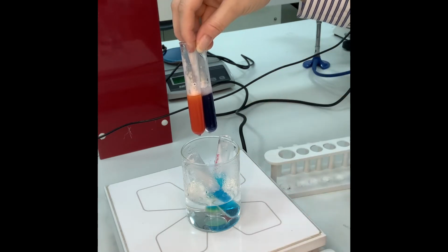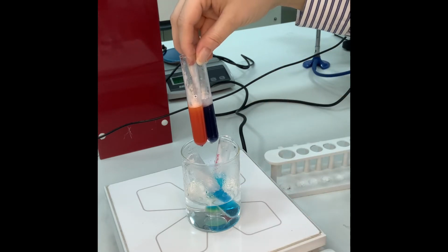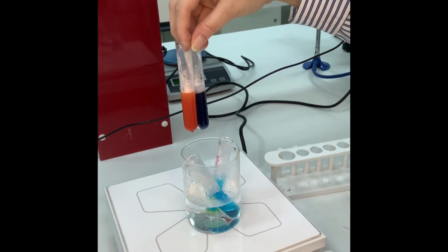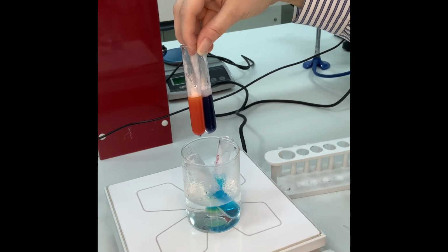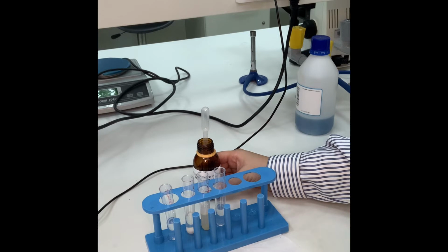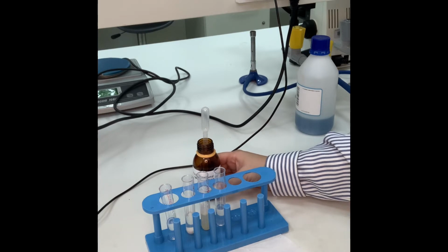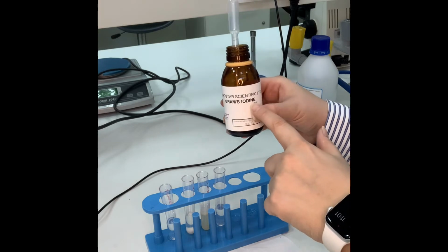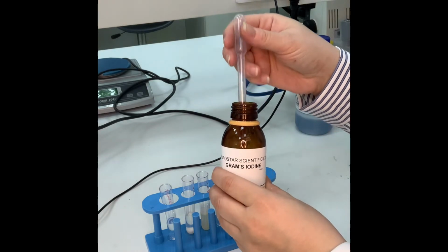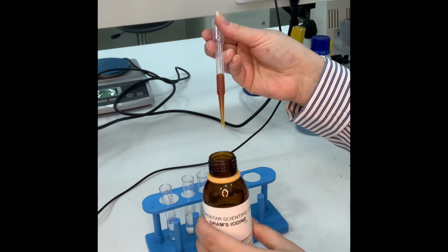So we will wait for that till it precipitates. Now for our second experiment, for starch testing. To test for starch, which is the second sub-classification of carbohydrate, as I explained earlier, we don't use the same reagent as for sugar. We use another reagent, it's the iodine over here. It's browny yellowish in coloration.